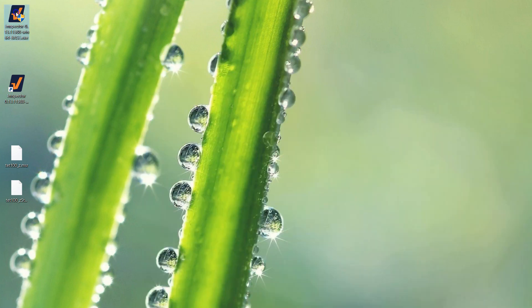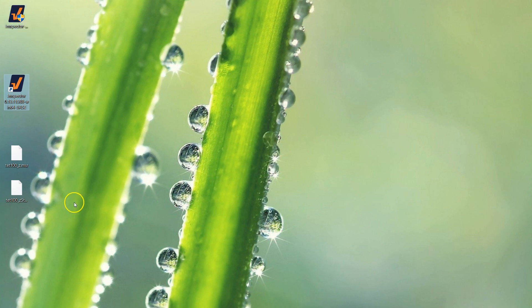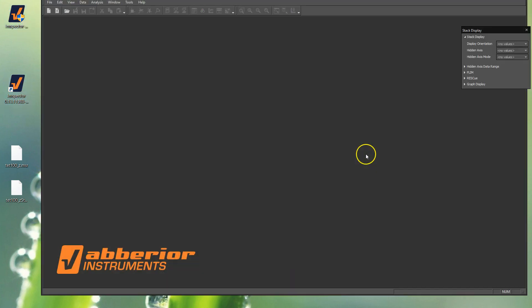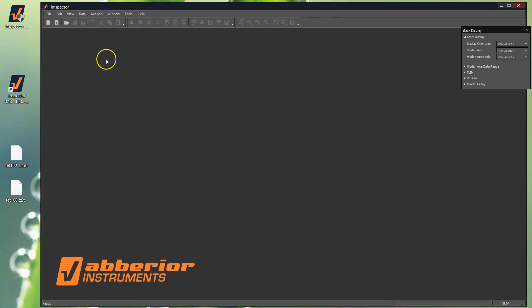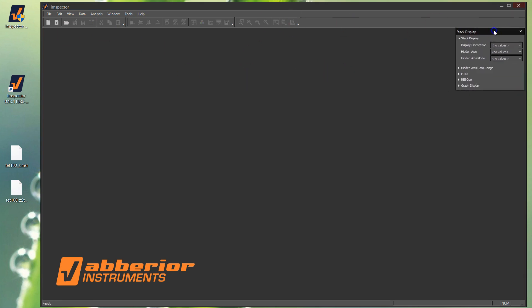So I've installed that. If you download and install the installer, you get the icon on the desktop. I went with the default settings on the install. There's a bunch of checkboxes, but just go with the default. So let's go ahead and open that up. I did notice that when I first changed the size of the window on my system, it reduced to a tiny little window and I had to find it and stretch it out. So that may happen.